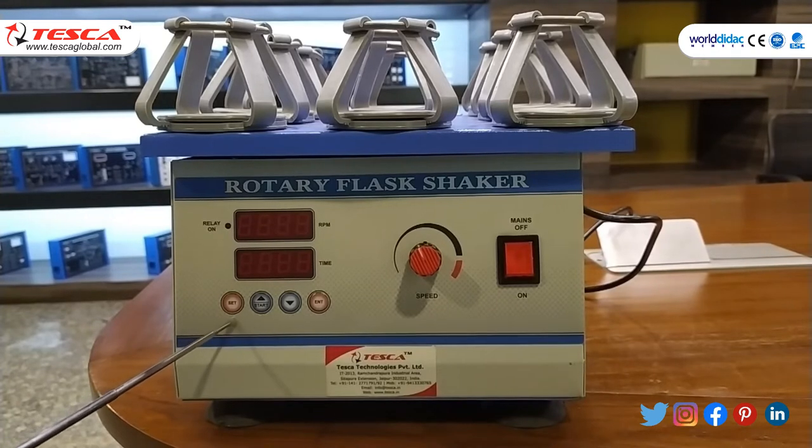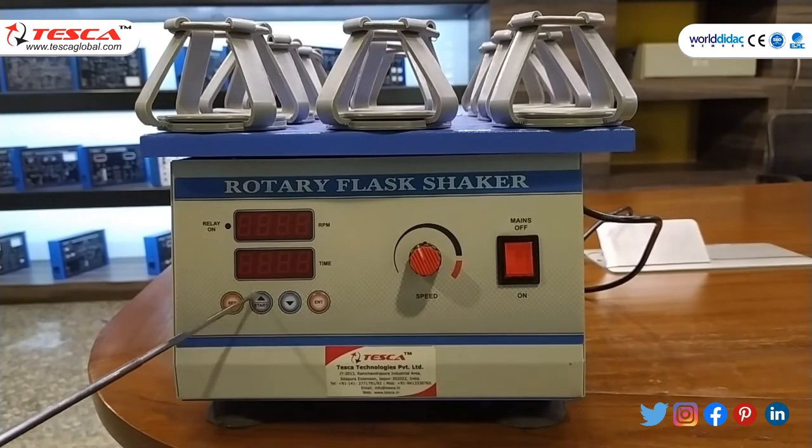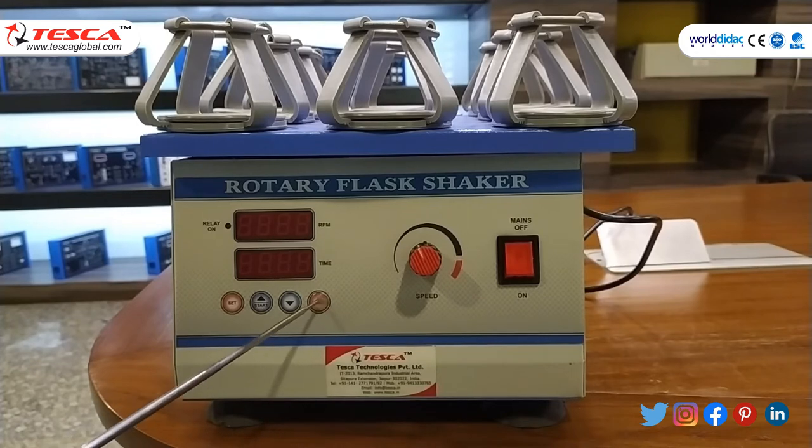This is the set button, this is start, this is the up and down button, and this is the ENT button.